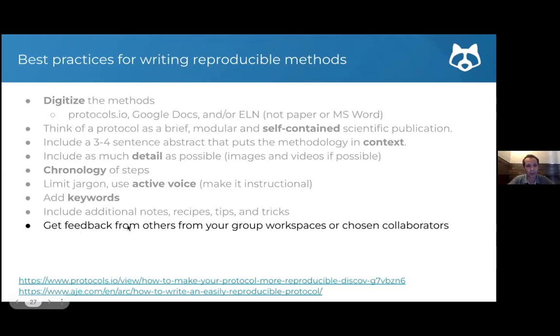And going back to our SpongeBob exercise, you're writing a protocol, you're using it every day for a year or more. It will seem intuitive, it will seem clear to you, but short of submitting it for peer review as part of a paper, just share it with other colleagues, even if they're not running through your protocol because it takes a month or a week and they have their own projects.